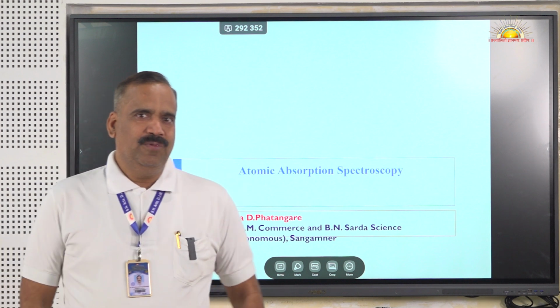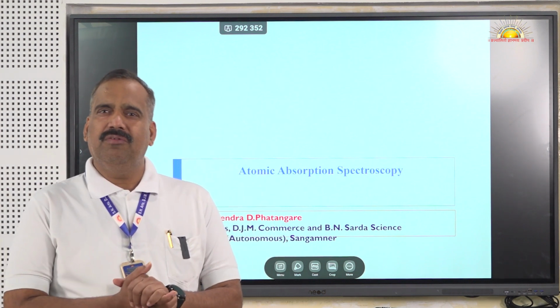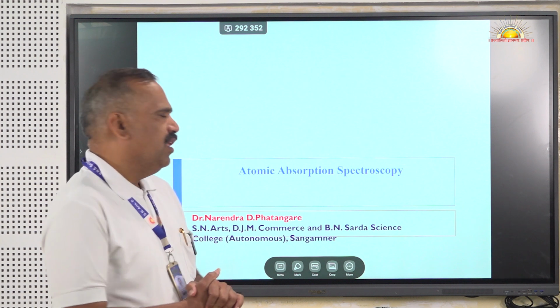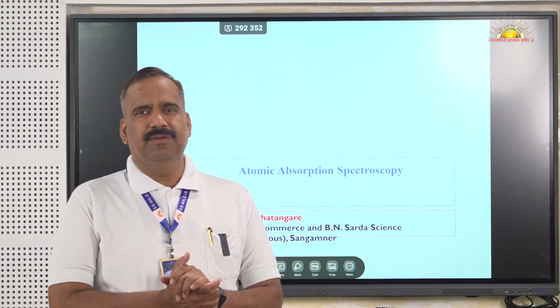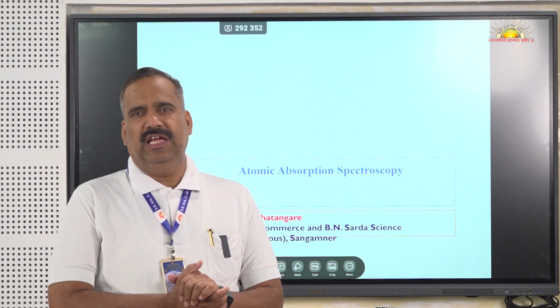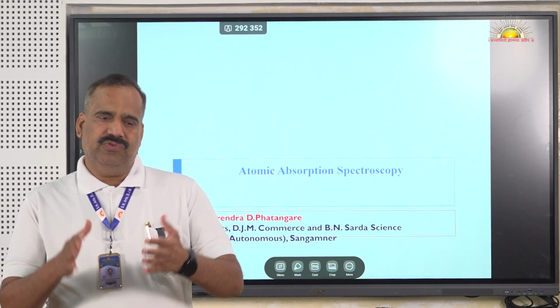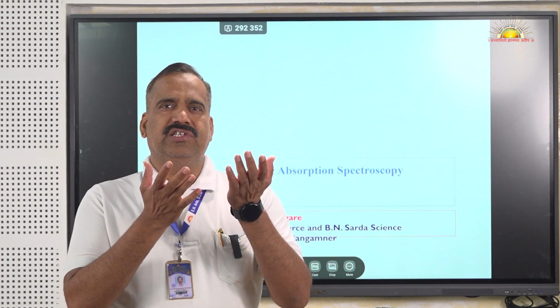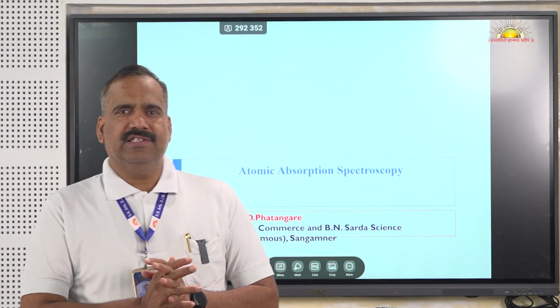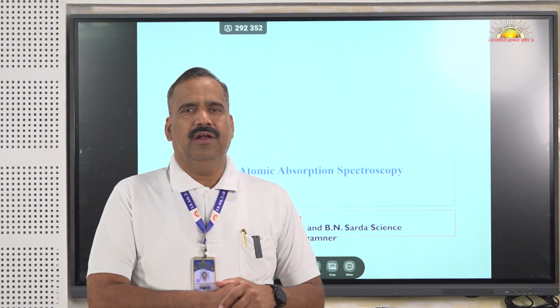Good afternoon, everybody. Today we are going to discuss the important topic of chemistry, that is atomic absorption spectroscopy. Generally, absorption spectroscopy depends upon the absorption of light. Whenever radiation is imparted on an atom or molecule, it goes to a higher excited state, and during that excitation it will emit some radiation and again come back to the ground state.